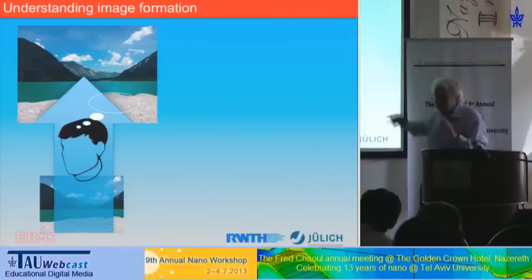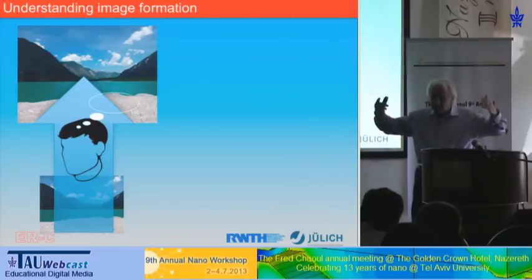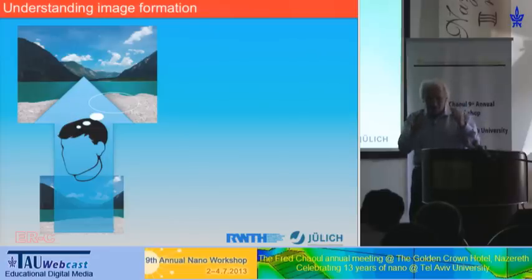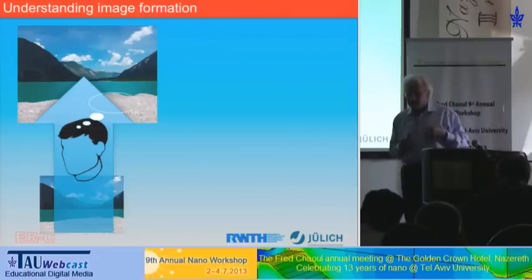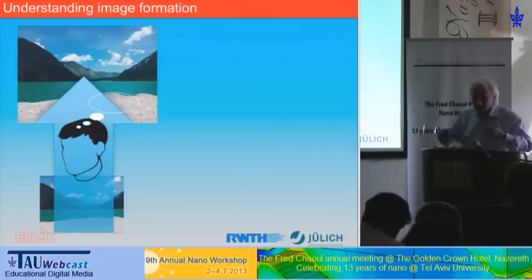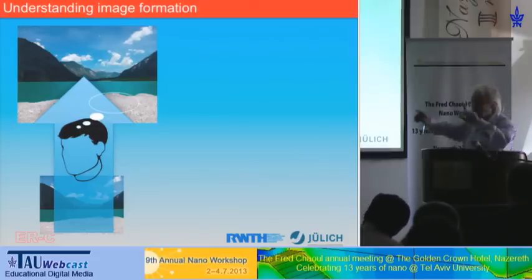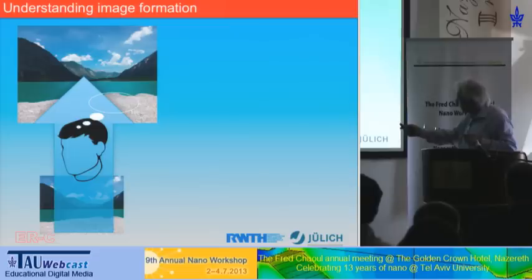So we have also brains. So also here, a brain comes in. So take Feynman's brain, or Schrödinger's, or Heisenberg's. They have created quantum mechanics, but nevertheless, their brains do not understand intuitively quantum mechanics. So we have to find a brain which understands quantum mechanics. And this is the computer. We can program, of course, the computer that it follows the quantum physical laws. That means the understanding of image formation, in our case, has to be done by the computer. That means we now have to invert the imaging process as the brain did it here.